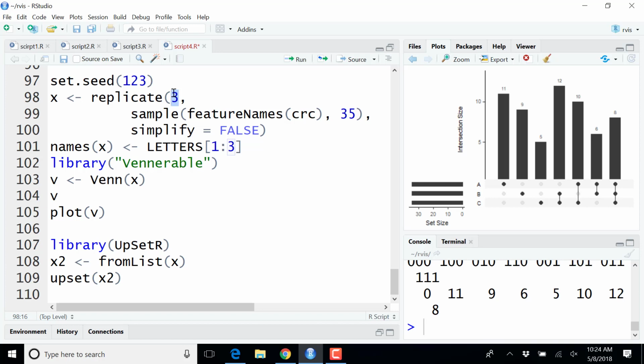Clearly, if you say 5, 6, you will still be able to produce a Venn diagram, but it will not be helpful at all, I guarantee you. And probably with 10, it will tell you that it can't draw one, at least not in 2 dimensions. So could you do that until 10:30, and then we'll have a refreshment break.